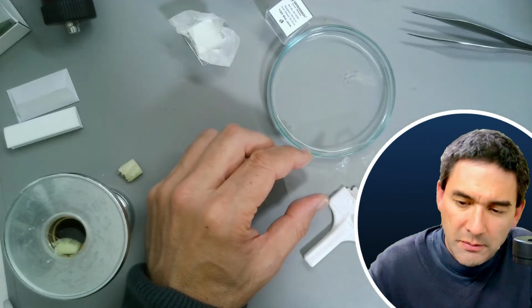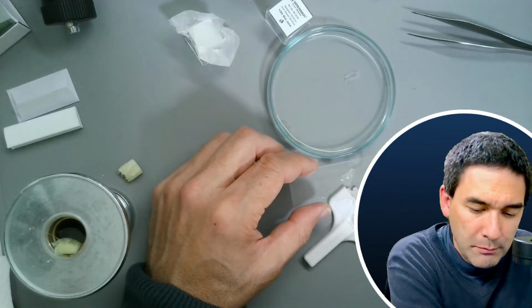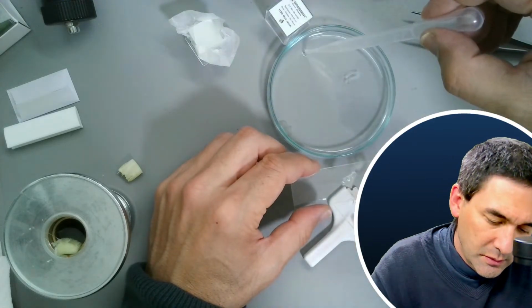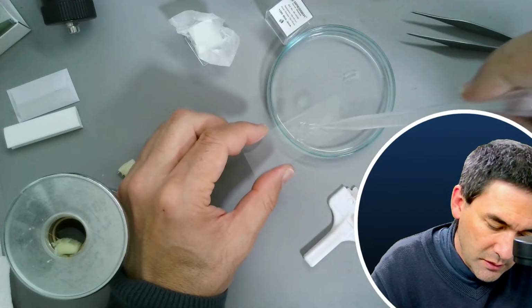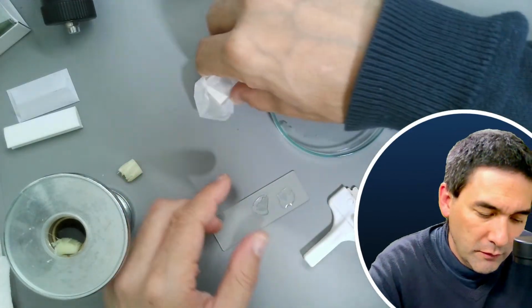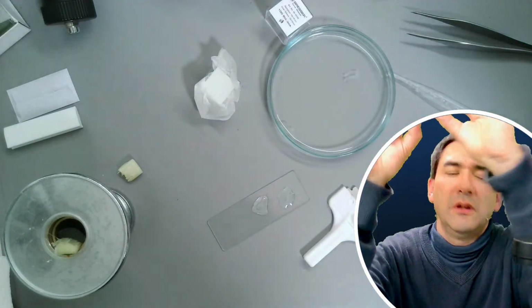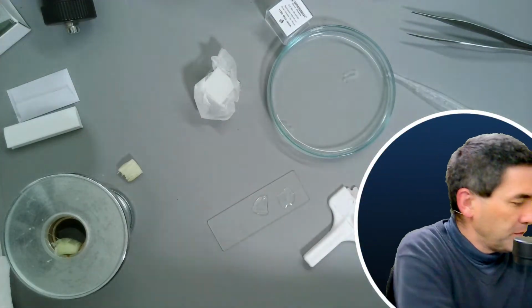Is this pipette clean? I used it yesterday to also pick up some pond water. So let's try here. Actually, I could have used some larger cover glasses as well. Those cover glasses are reasonably clean.